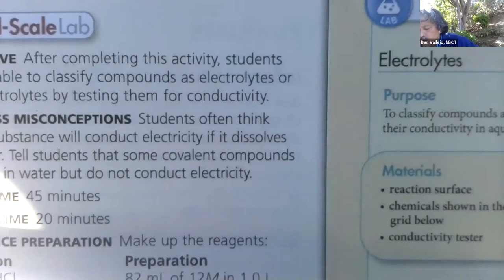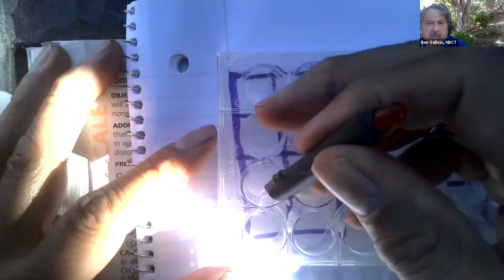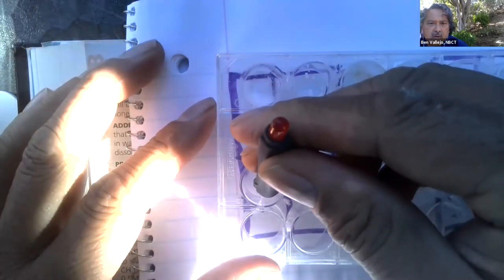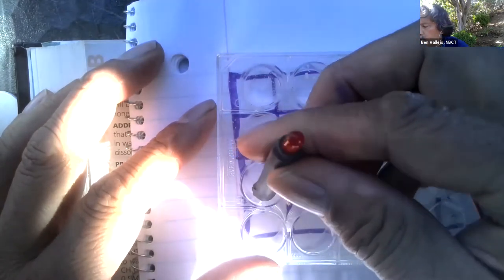Okay, the next one is baking soda. Baking soda is NaHCO3. And if you remember from what we just did, that dissociates into sodium and the hydrogen carbonate. So let's pan out just a little bit. And I'm going to touch the electrodes to this one right here, which has the baking soda. So let's do that. Here we go. Watch the light though. Ready, set, go. Okay. Pretty good reaction there.